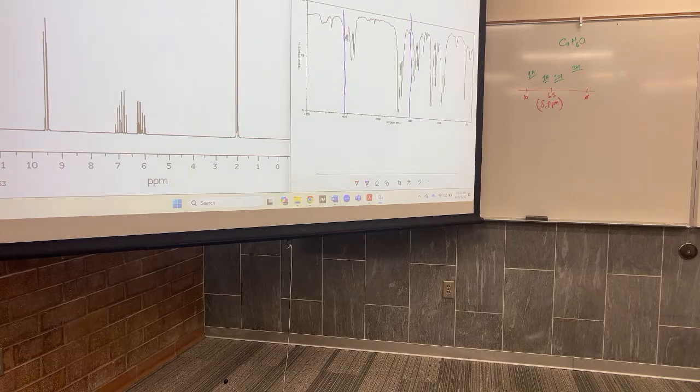But remember that some functional groups that show up in the IR also show up in the NMR. So you might be able to use both IR and NMR to help approximate some functional groups. Yeah? Do you see evidence of this? Yeah, I don't either. I mean, there's something up there, but it just doesn't look like what it normally does, which is very deep, very strong.